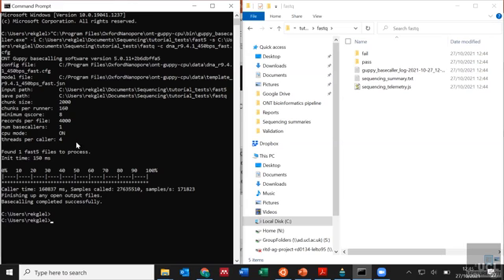Threads per caller, yes, sorry. Okay, and you say it depends on the power of the computer. If I have a computer of 8 gig of RAM, how many cores can I put? So it's not to do with the RAM, it's to do with the cores.